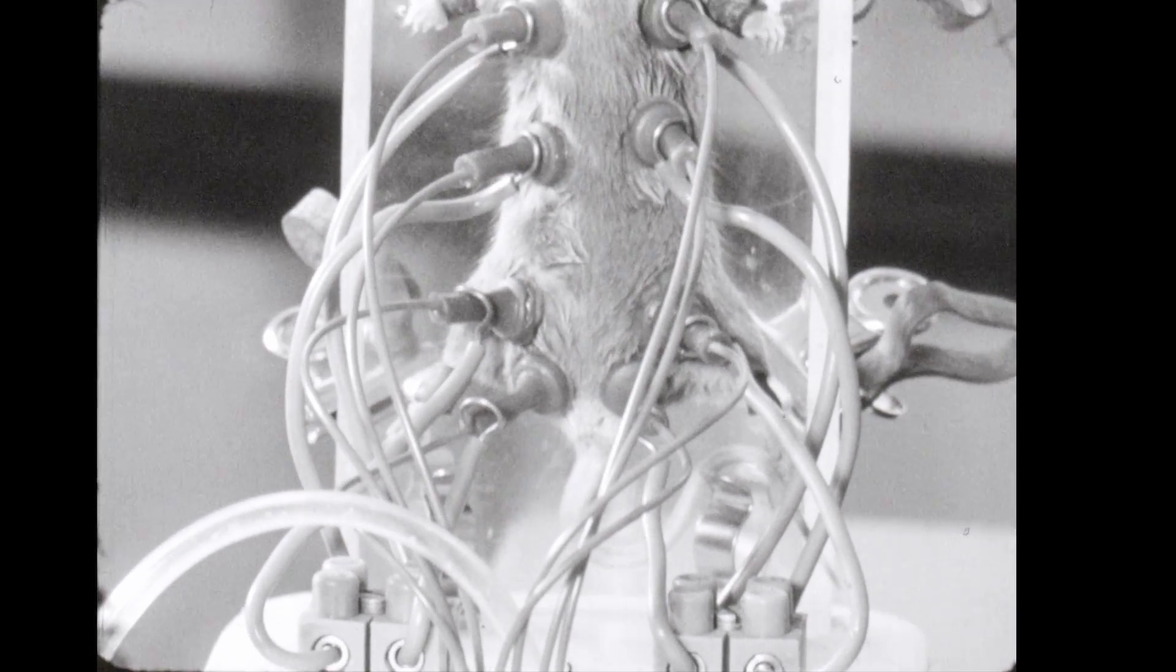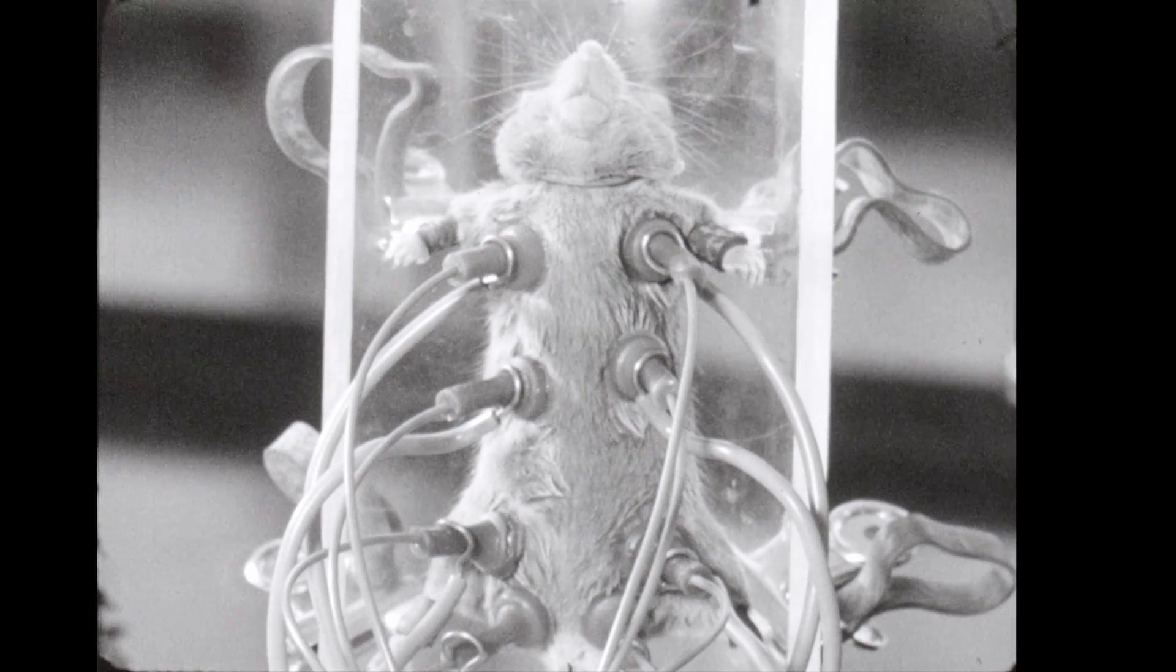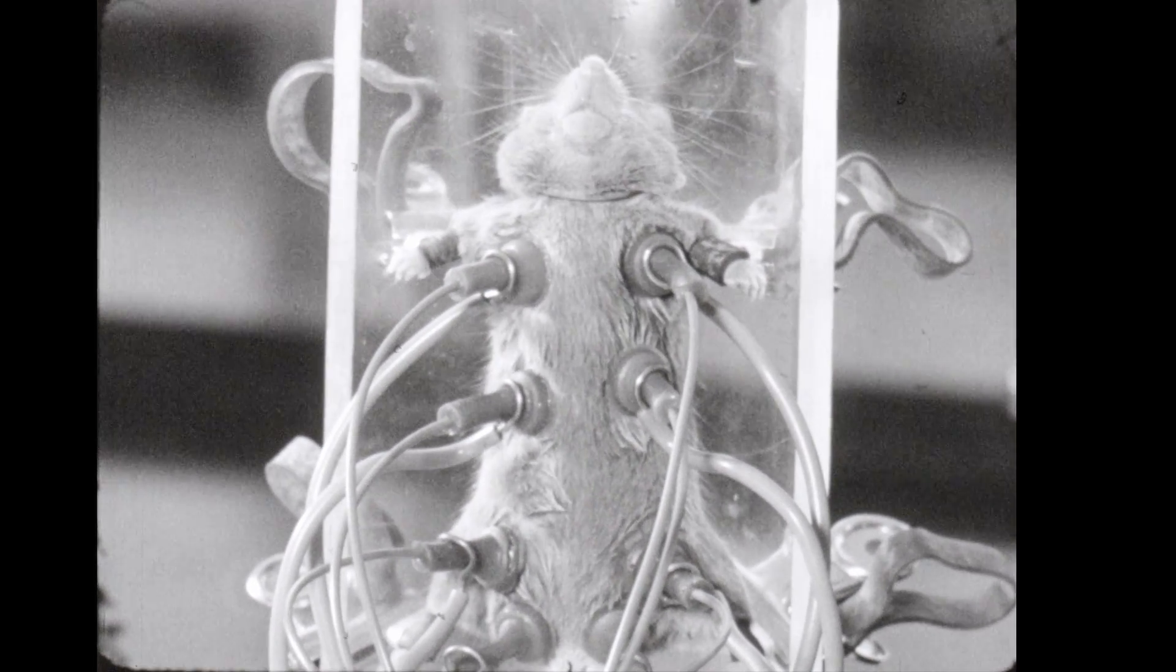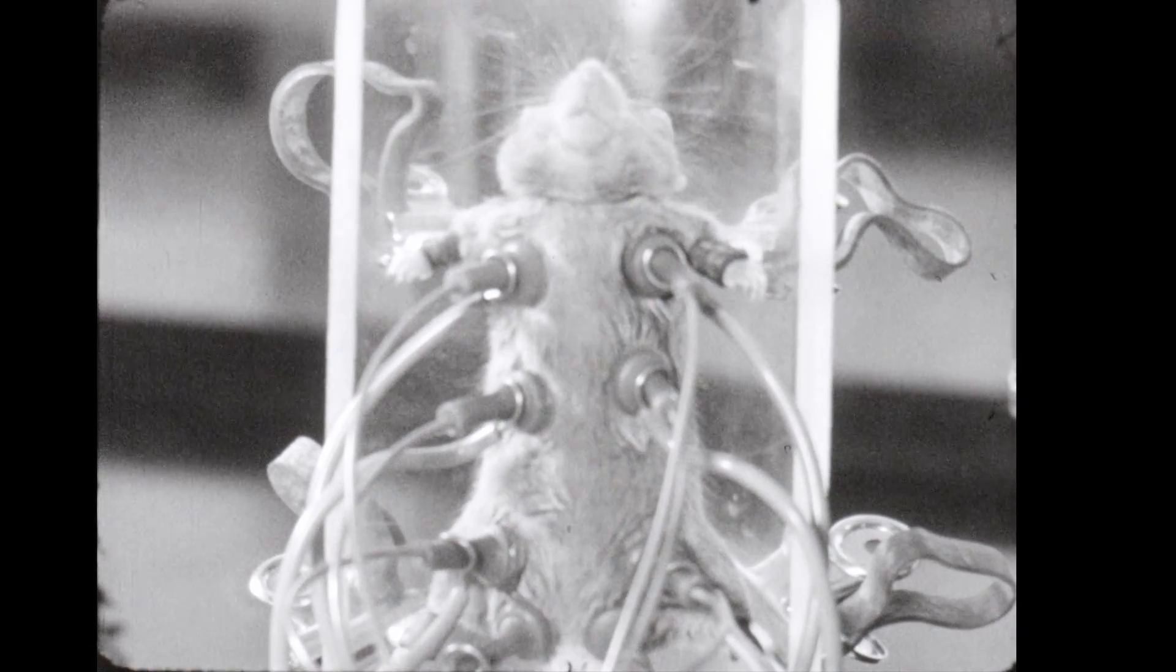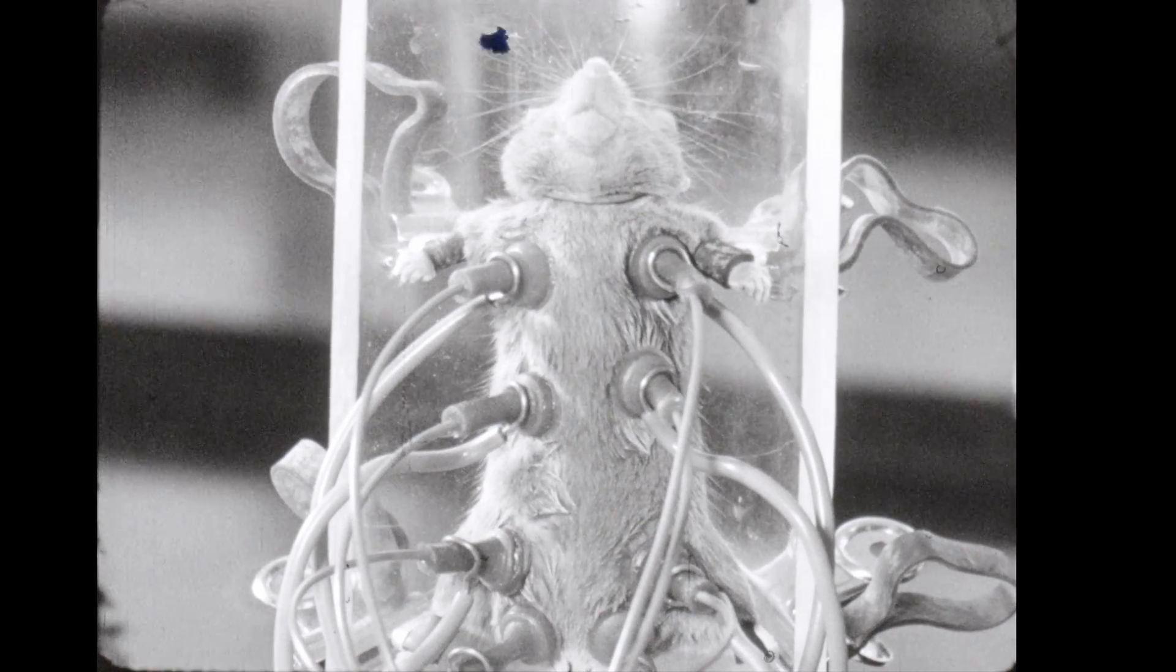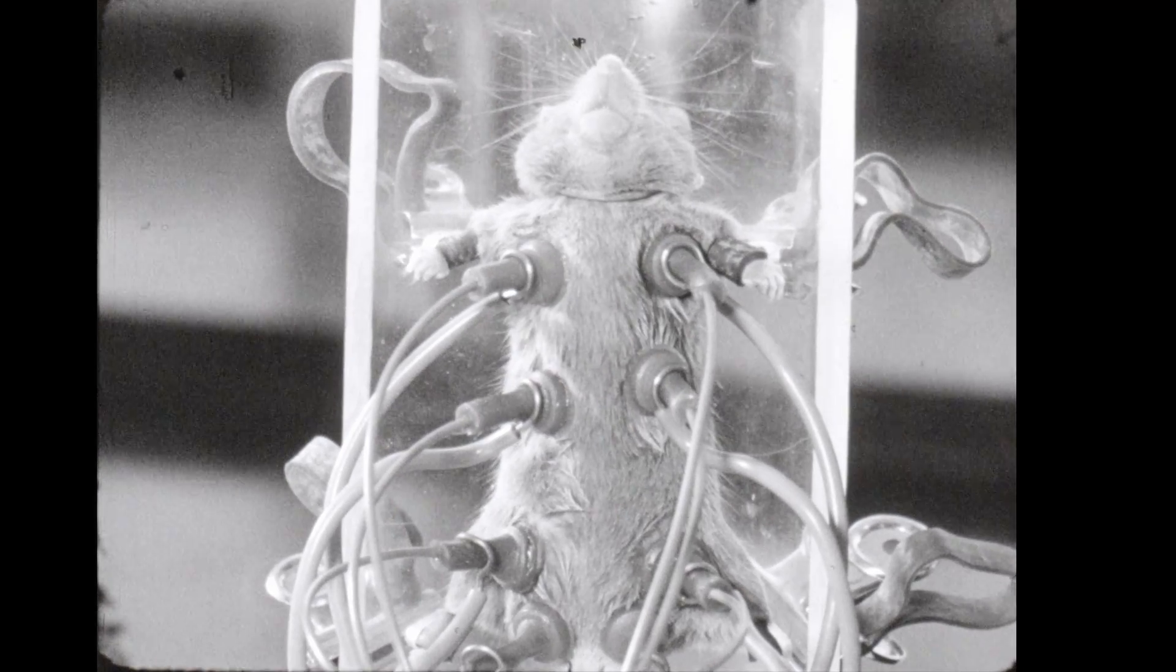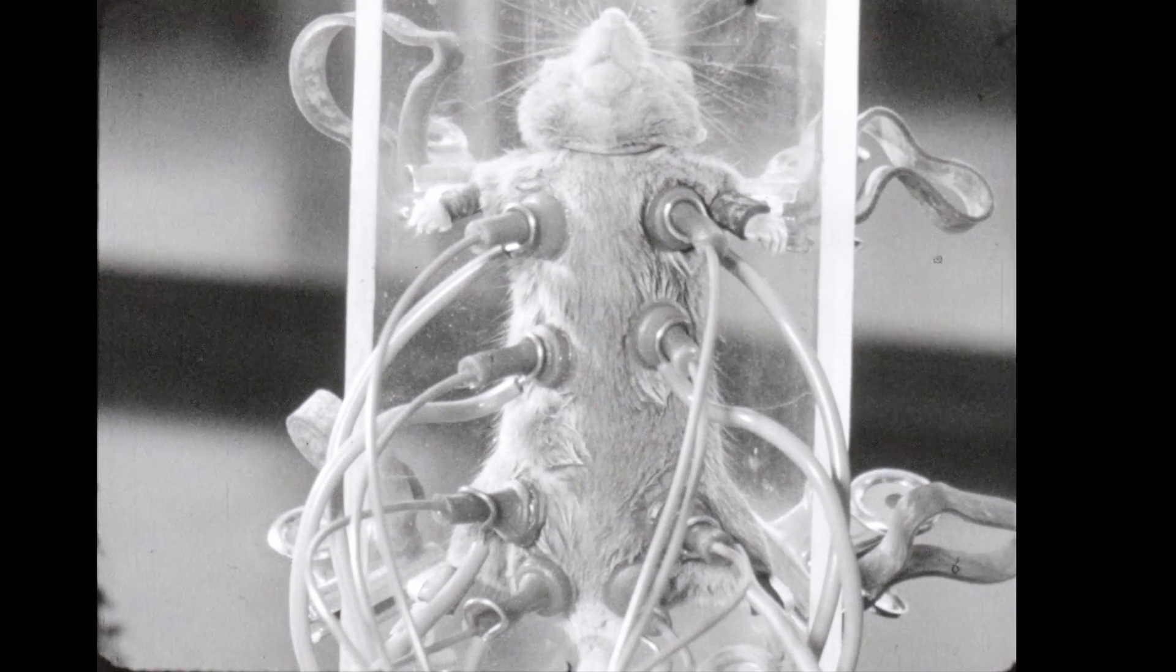Although a mouse has ten teats, the milking machine has only eight teat cups. The teats are often too close together to apply ten teat cups at the same time. Different milking out times enable cups to be transferred to unmilked teats.